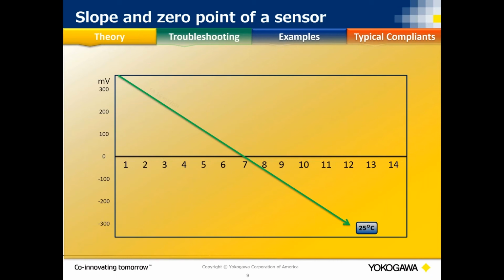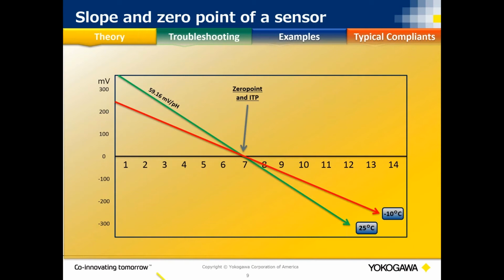So the other thing about temperature is, remember I mentioned the Nernst compensation. With a perfect slope pH glass electrode, one pH change is equivalent to 59.16 millivolts. Because of the way the glass is made, it actually will change with temperature. So the Nernst or automatic temperature compensation, or what we call Nernst compensation, accounts for this. At higher or lower temperatures, that 59.16 millivolts is slightly different, okay? So that is what we just want you to remember out of the theory of pH.